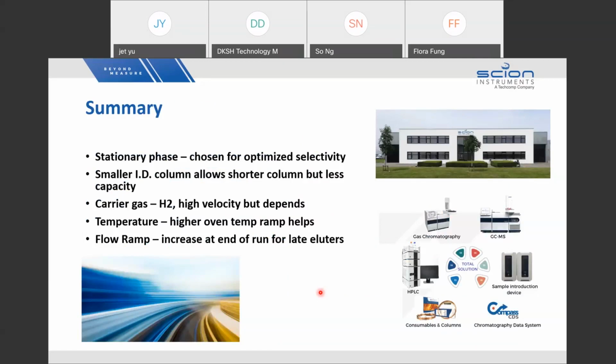If you are not clear, you can Google and search for information on the compounds. Generally, when there are a number of hydroxyl (OH) groups, it is very polar. Oils, on the other hand, are non-polar. Think about this.